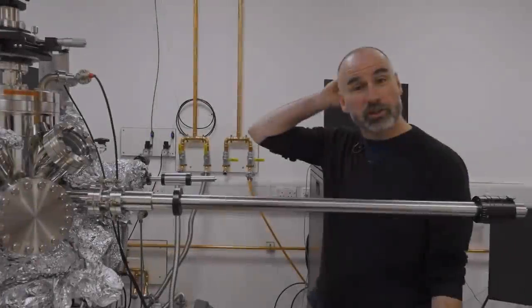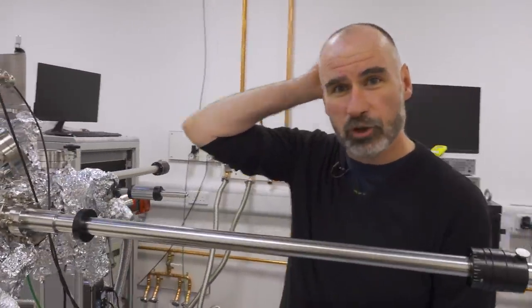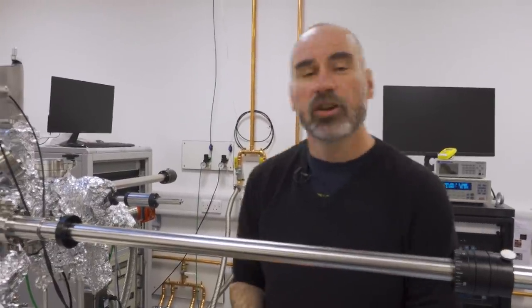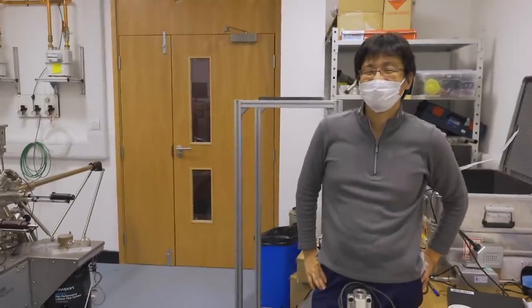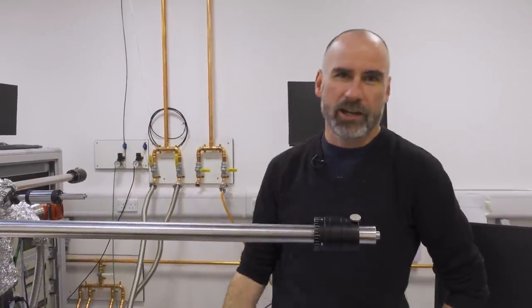So, right, day 45. It's reached its base temperature, which is about 300 millikelvin, which is about 10 times colder than the deepest, darkest depths of the universe, because the cosmic microwave background radiation is around 2.7 K. We have Yutaka visiting us from the company Unisoku, who's the CEO of Unisoku, who has played an absolute stormer, has been incredibly good, and another magician like Thomas in terms of getting the system up and running, training us on how to use it.